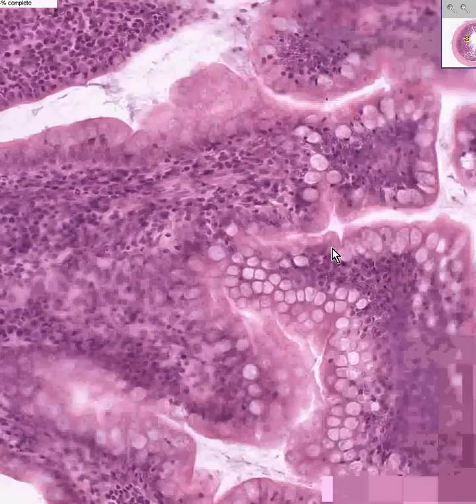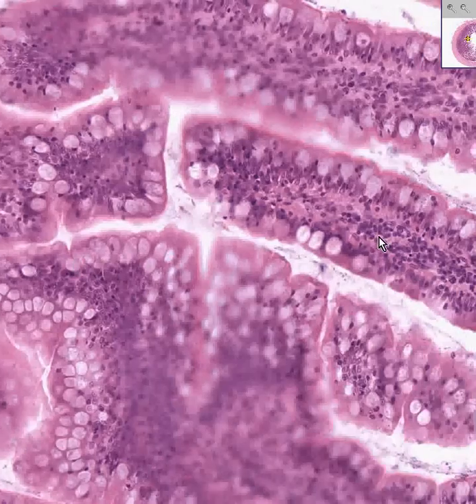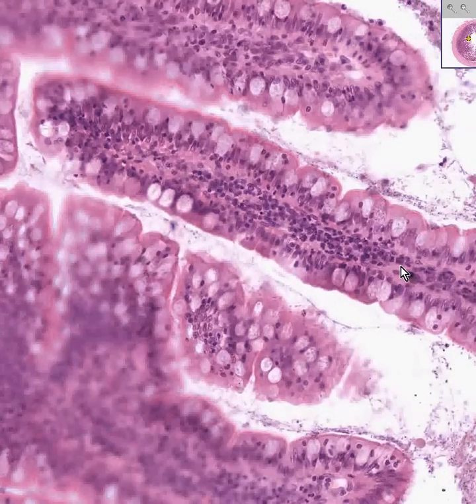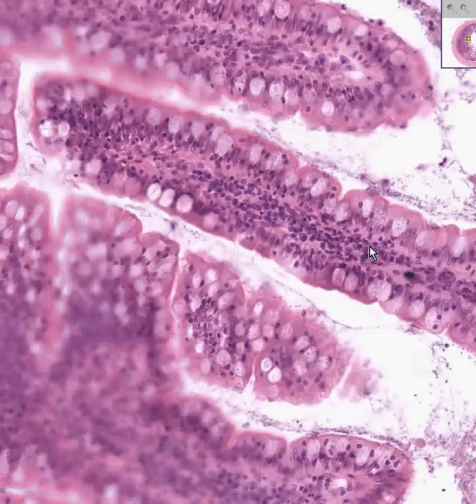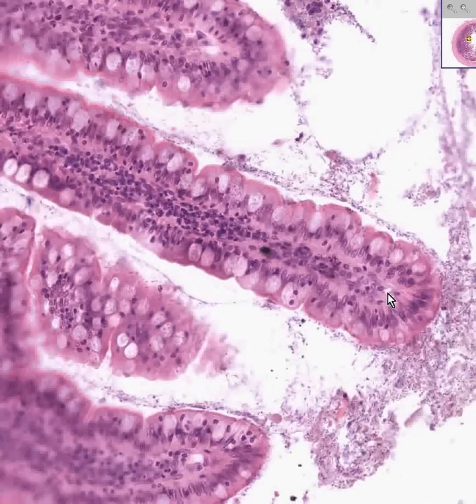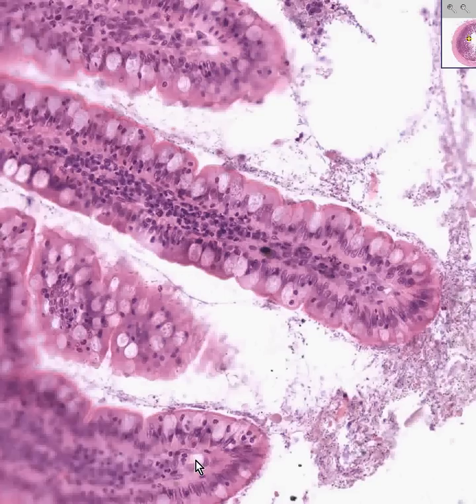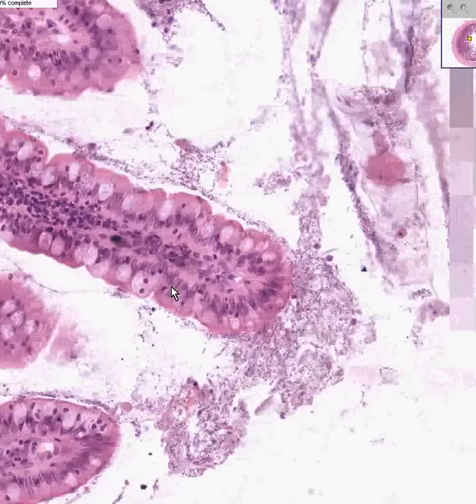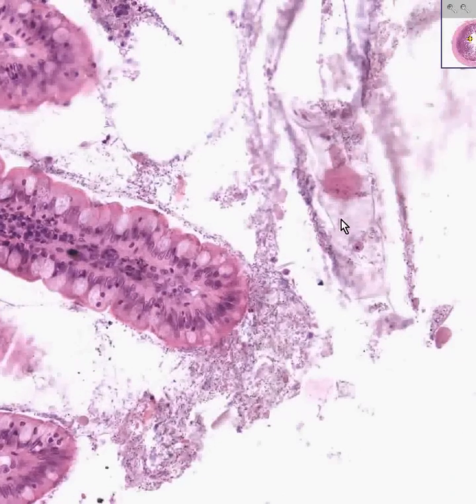We can see goblet cells, absorptive cells, and at the very surface these nice perfect little villi. Most of these cells in the lamina propria are plasma cells, lymphocytes, and macrophages. That's either a capillary or a lymphatic — that's probably a lymphatic. The rest of this is luminal content, and you can even see tiny bacterial rods as well. Thank you very much.